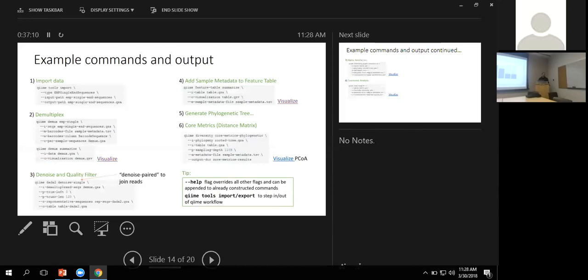That's okay. About the clusters, they added more options, like more algorithms, and also for removing chimeras, like vsearch. vSearch is implemented in QIIME 2 too. Right. Yeah. How about clusters? Clustering is typically done through DADA2 or Deblur in QIIME 2. Those are the two main tools that are implemented. Right. Oh, really? Oh, okay. And that is a huge step forward. Yeah. Expected more options. But yeah. Sure.